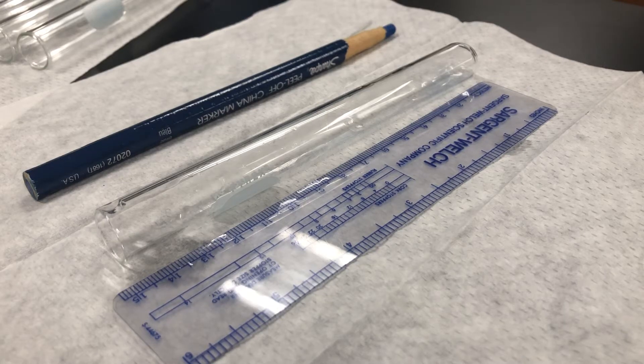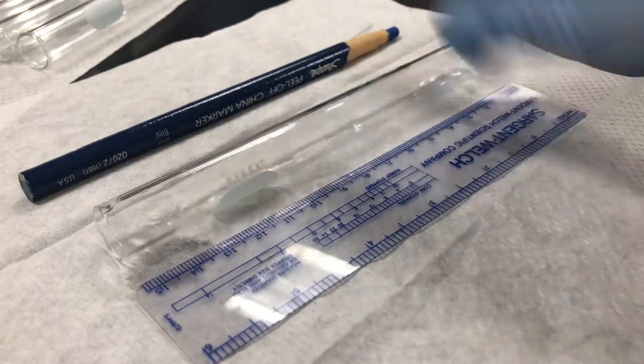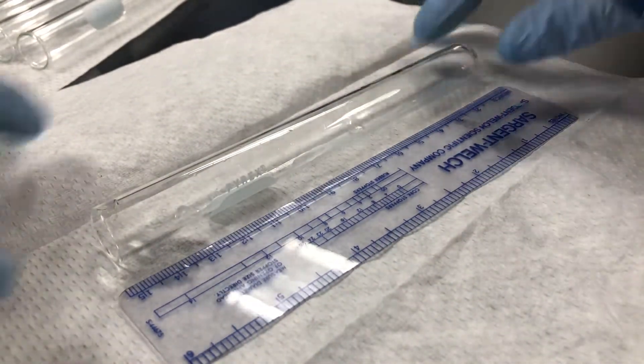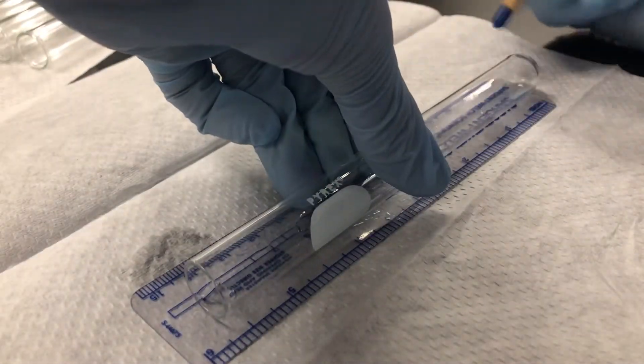Setting up your test tubes for the Benedict's, Biuret, or Iodine test is very simple. You just need a wax pencil, a ruler, and your test tube. I like to put it on a paper towel sometimes so I can see the numbers better, but that's not necessary. Take your test tube and approximately line up the end with the end of the ruler.